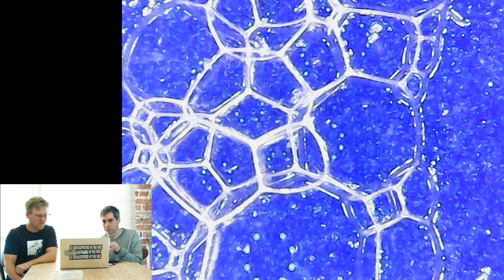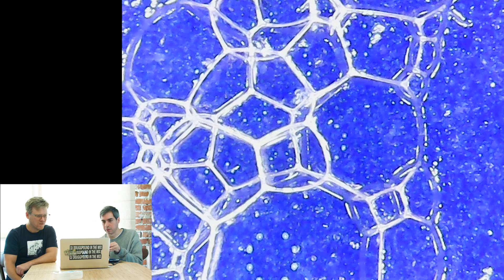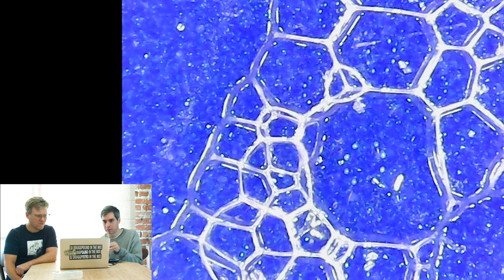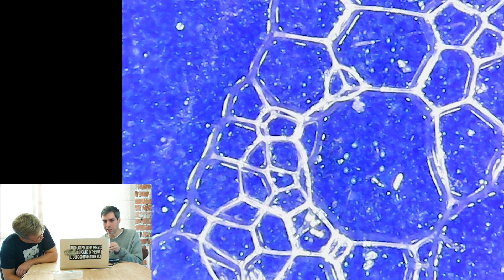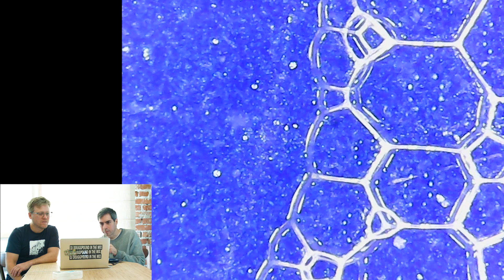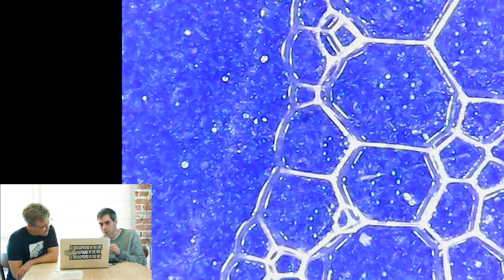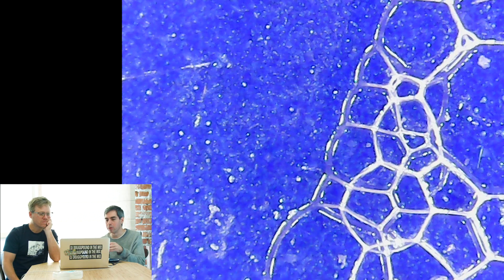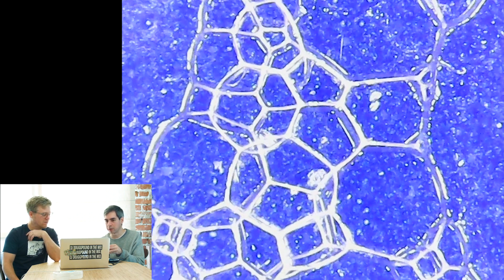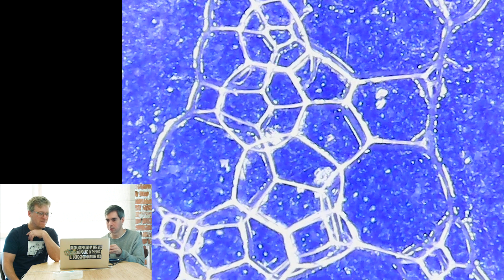Weird how you see these particles — whatever these particles are. I guess those are just the last of the bubbles. Look, there's like clouds going across the sky. What the heck is that? They're going beyond the bubbles. So weird. Is that on the plate, or is that just something floating in the sky? Oh! It was a big bubble that was on... it was a bubble on the thing. There was a whole entire sheath — like a membrane of soap that was covering the lens completely. So that's what we were seeing. That's why we were seeing all those floating things.